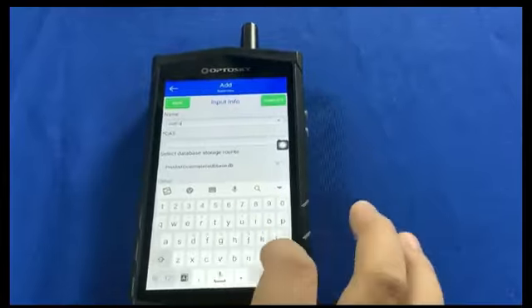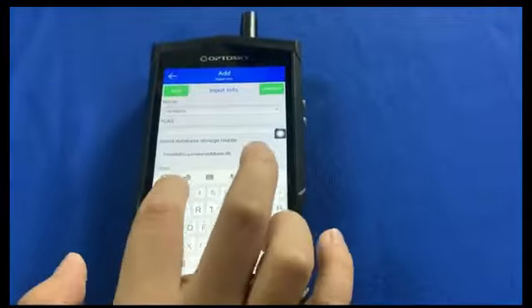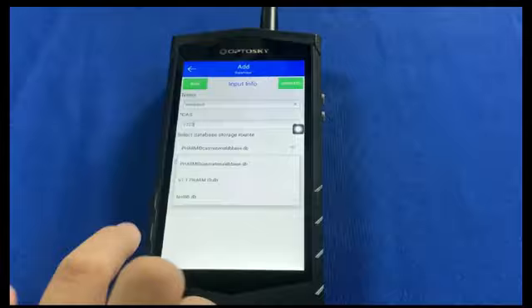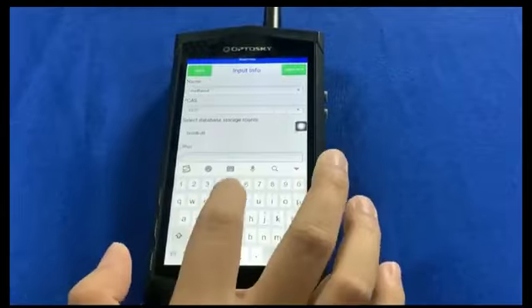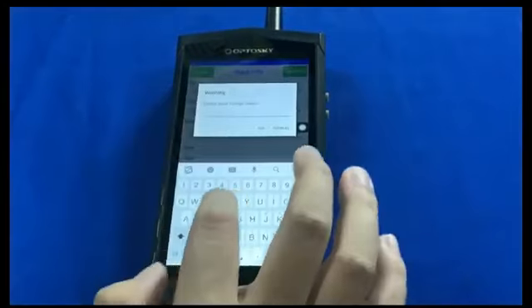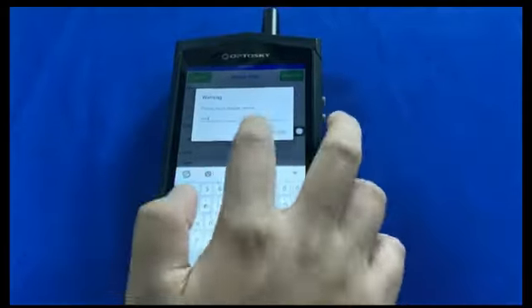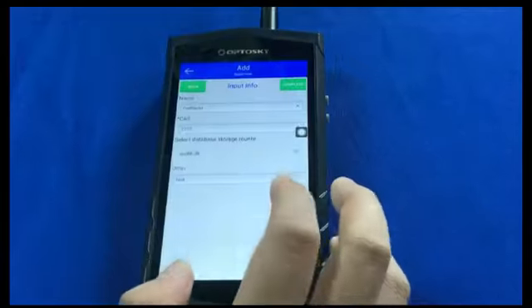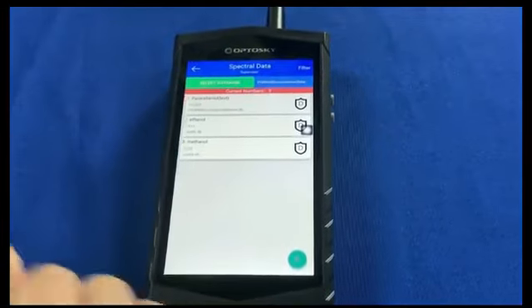Lastly, we use the scan. Select scan test to scan the ethanol, methanol, it's a 99% match, and input the batch.